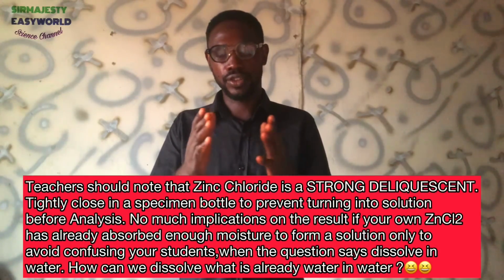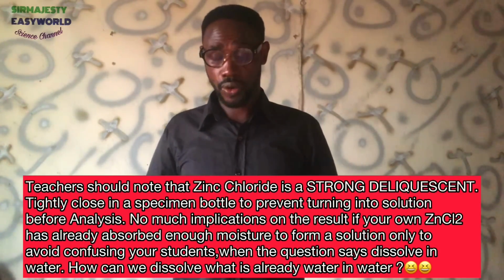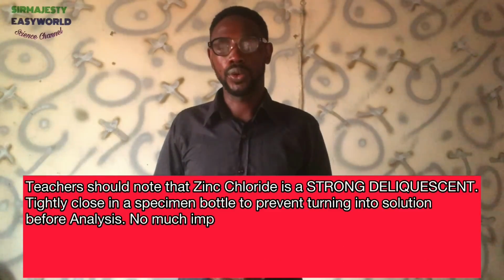Okay, but WAEC could give you the questions for you to make the table, draft your tests, then make your observation and inference from the questions they give you. Okay, I will be running it both ways. So you might be told to dissolve sample C in water, which is zinc chloride, and stir, test with litmus. You say it dissolves to form a clear solution.